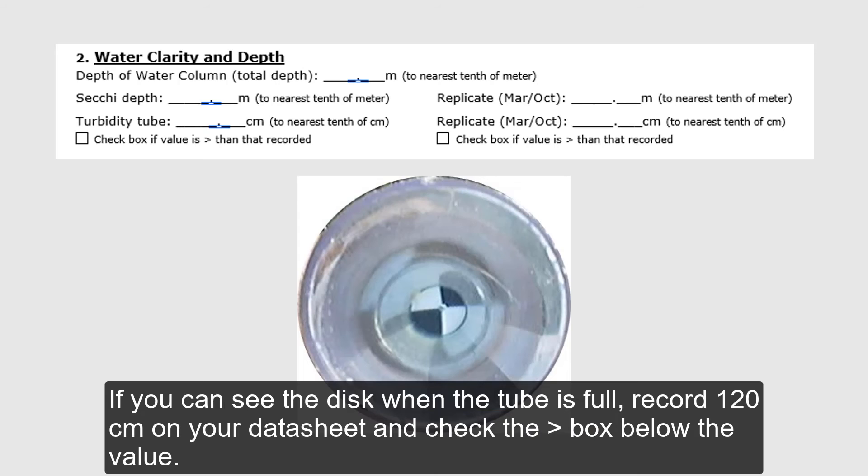If you can see the pattern when the tube is full, record 120 cm on your datasheet and check the greater than box below the value.